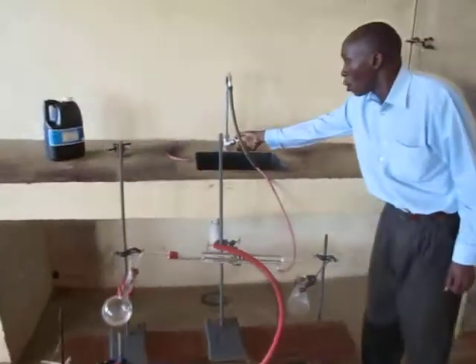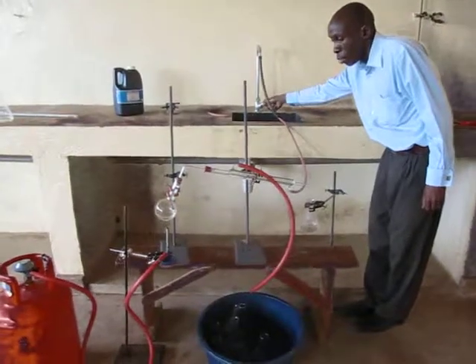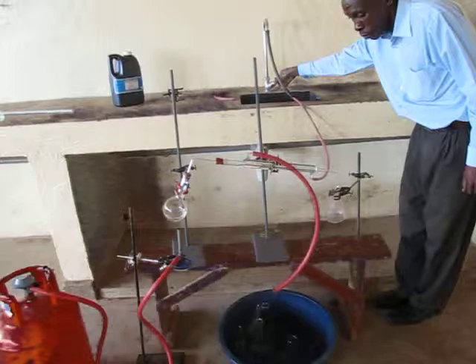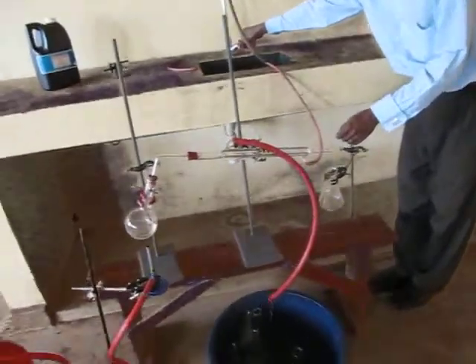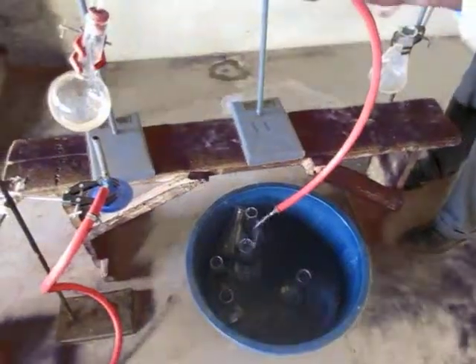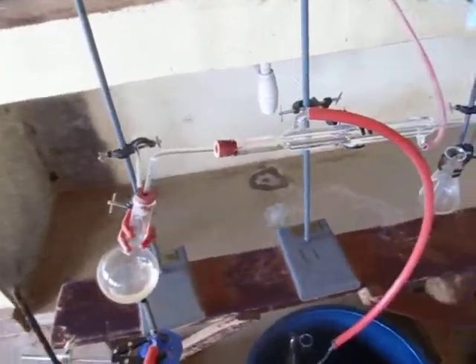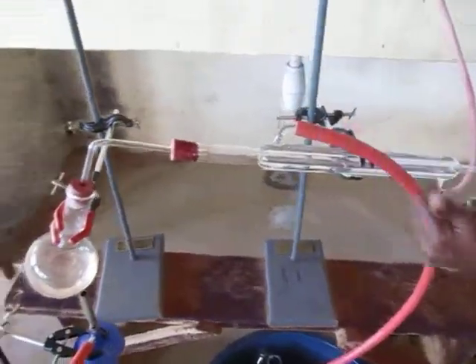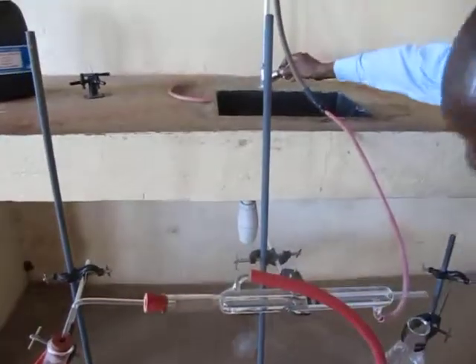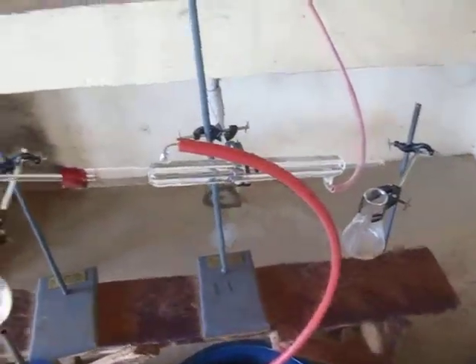So now we turn on the tap to get running water, slowly. Now you can see water is moving. Water moves from the tap up the condenser, out. And that water should be made to run continuously.